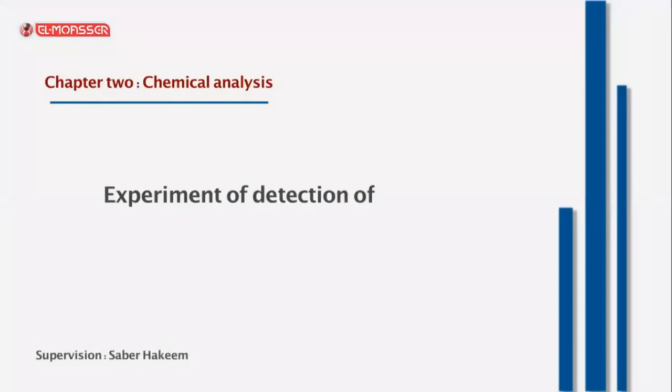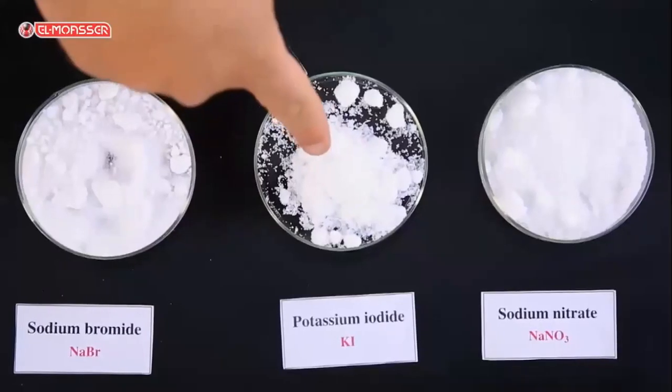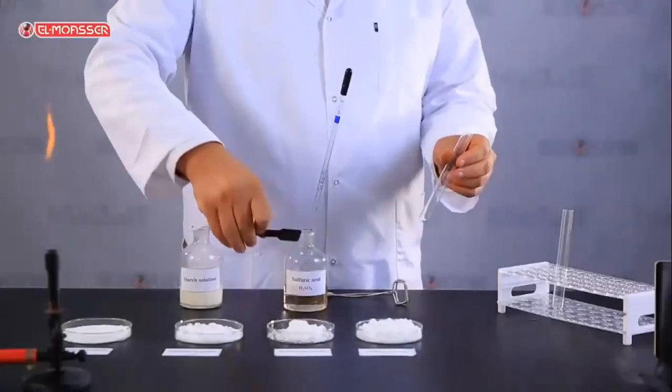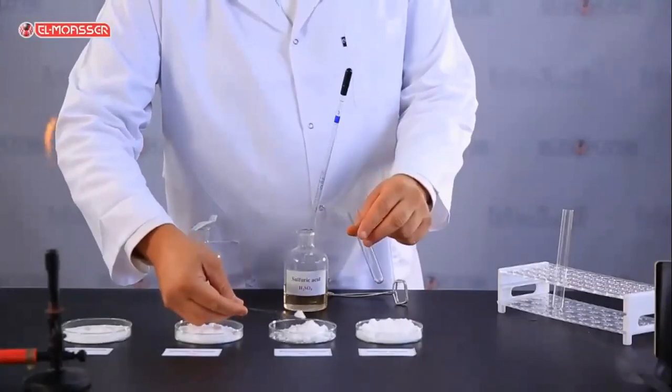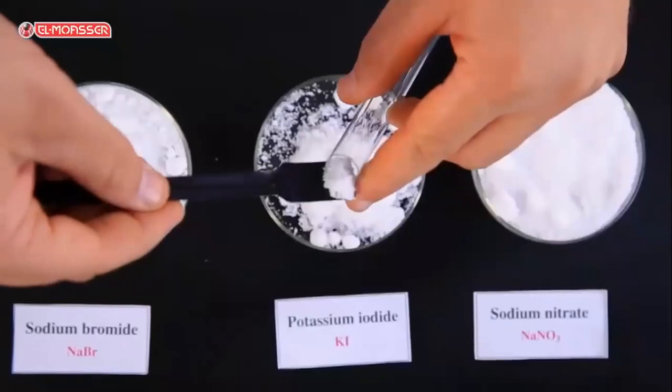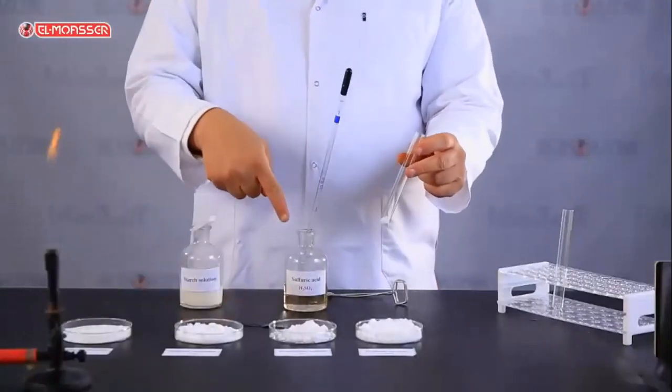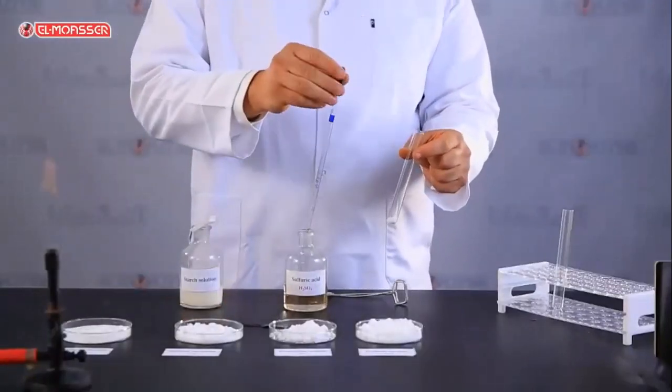Experiment of detection of iodide anion. Iodide anion is detected in potassium iodide salt by a main experiment and another confirmatory experiment. Main experiment. Add to potassium iodide salt drops of the group reagent, which is concentrated sulfuric acid.